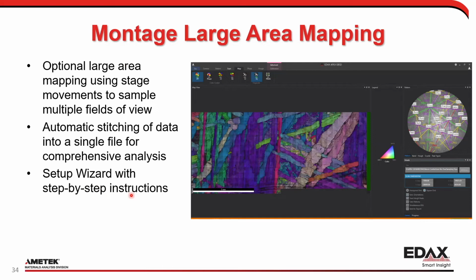When we do this kind of large field mapping mode, there's a lot of assumptions made on the stage movements, and the stage movements are not often as well calibrated as you would expect. So we're basically saying, hey, move one field of view, and then you get a 1% error on that, and they can actually add up really big. Honestly, the biggest issue tends to be tilt.